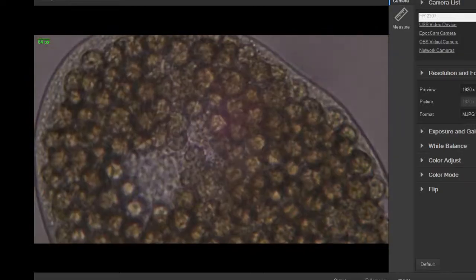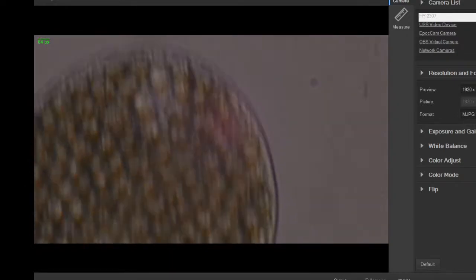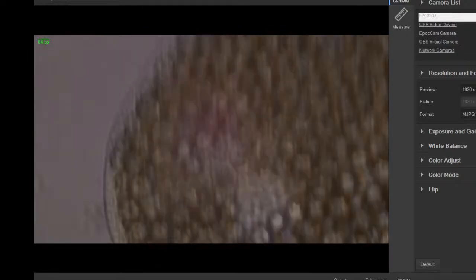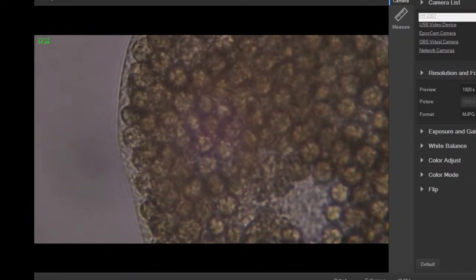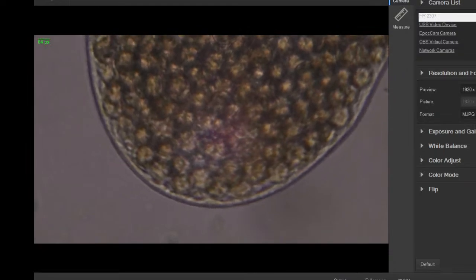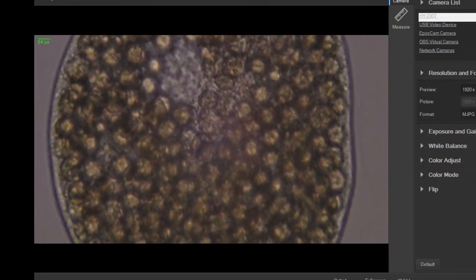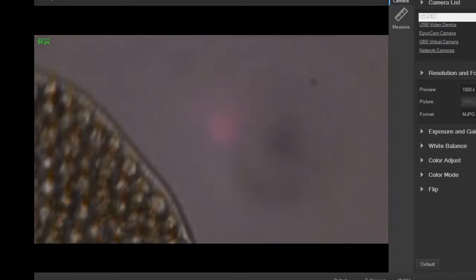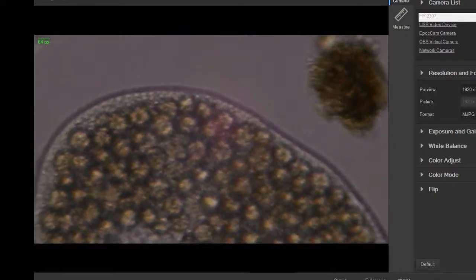This might be, there's one called blepharisma, which is a very large ciliate that often has these structures in it, but not always, from what I've seen. And oh, you can see that, that is cool. Do you see that thing moving the back end there? That is a contractile vacuole, I believe. That structure on the back end that's kind of opaque, kind of white colored, changing shape. That's a contractile vacuole.